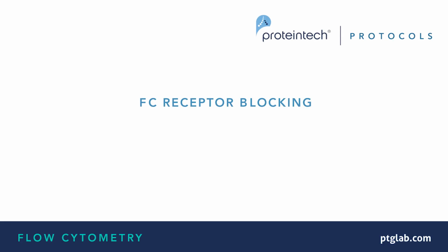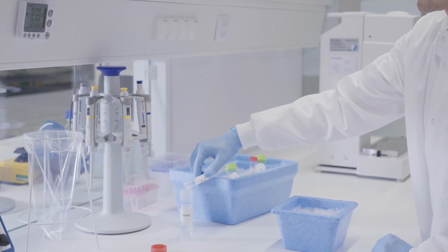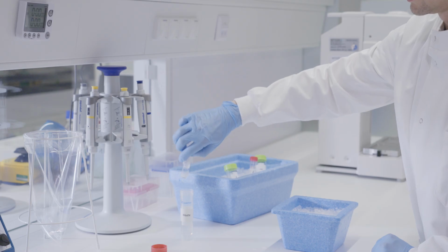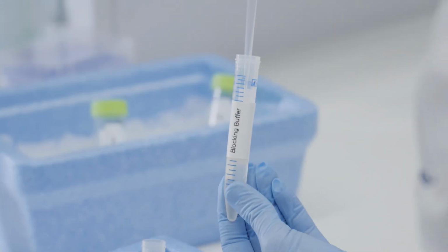Nonspecific binding of antibodies to Fc receptors in your sample can cause high background signal in your data. To reduce background, resuspend your cells in blocking buffer containing 10% serum.